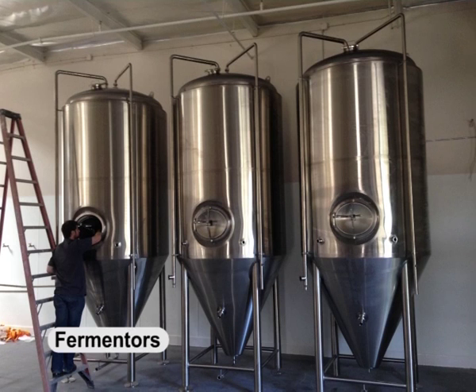Fermenters may be liquid, also known as submerged, or solid state, also known as surface type. Most fermenters used in industry are of the submerged type because the submerged fermenter saves space and is more amenable to engineering control and design.